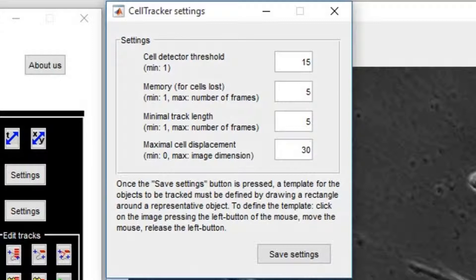Minimal track length is the minimum number of frames for which a cell has to be tracked in order to be considered as a valid data point.